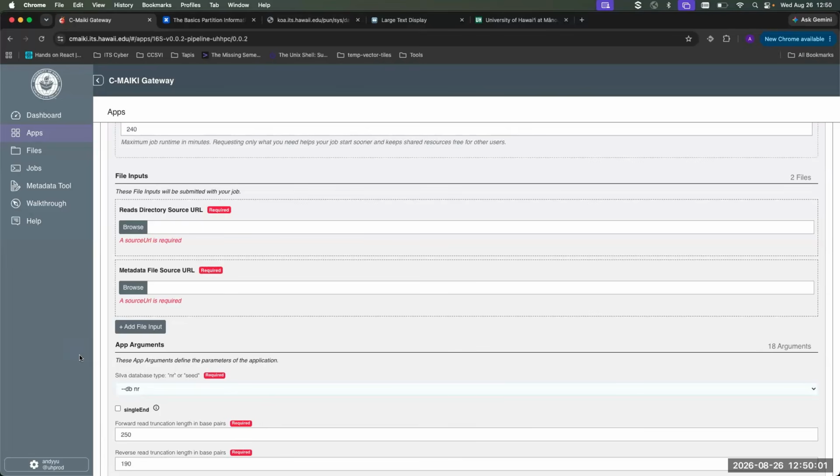Remember, this tool is for people who cannot code in command line interface. So it's really only for things that have high use and low user expertise. That's really why right now it's only tailored to 16S and ITS. But certainly adding apps, that's what it's for, right? It's supposed to be a thing. Like if a lot of people want to start doing eDNA and they all want CO1 pipelines, that's why we've been developing, because everybody's going to need it.